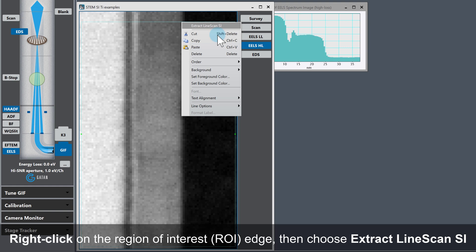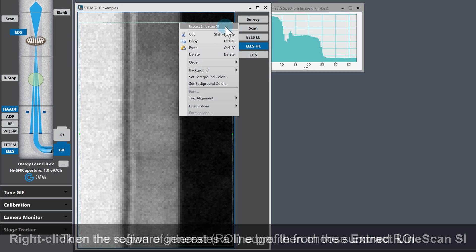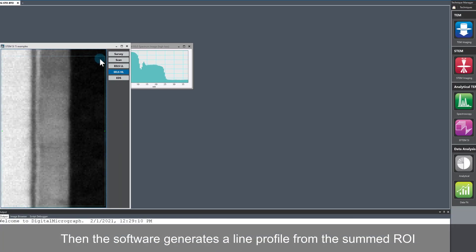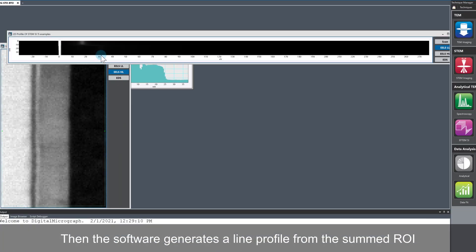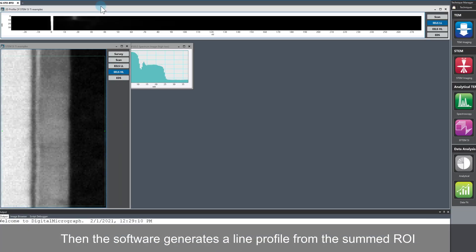The software then generates a line profile from the summed region in the ROI you defined. It's as simple as that.